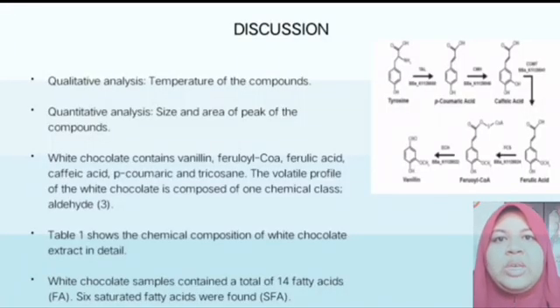Gas chromatography (GC) was used in this experiment because it is only capable of analyzing volatile and semi-volatile compounds, ranging in molecular weight from helium and hydrogen to roughly 1250. The flame ionization detector (FID) is a good choice for this investigation since it detects hydrocarbons but not non-carbon containing substances.